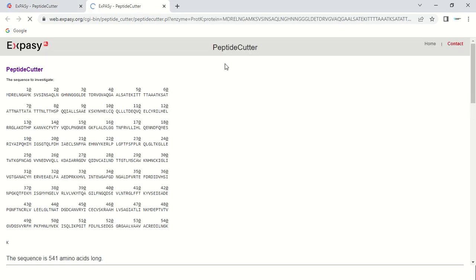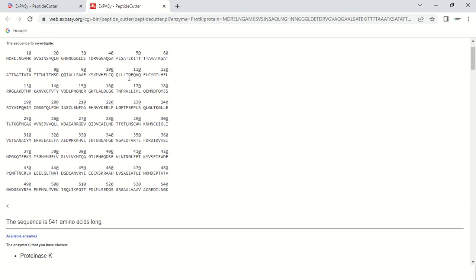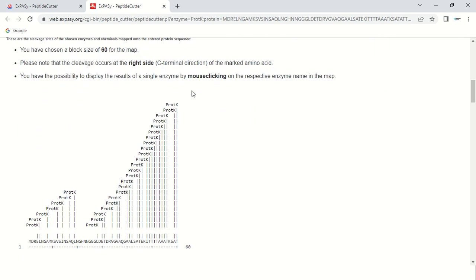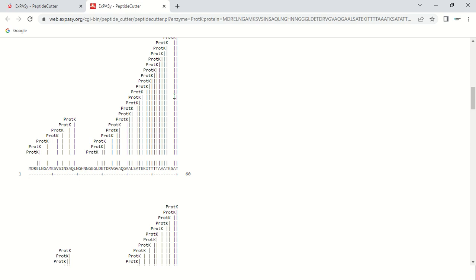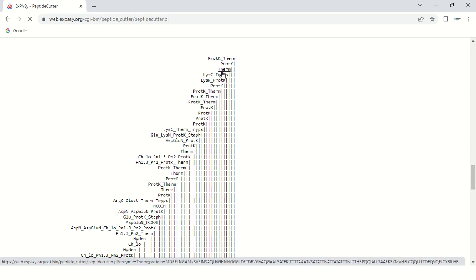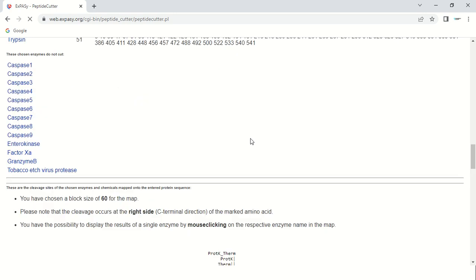Clicking on an enzyme name opens a new window showing the result for that particular enzyme. For example, clicking on Proteinase K shows that this sequence was submitted, and the result is specifically for Proteinase K. In this window, only the results for Proteinase K are visible — it has 284 cleavage sites in our sequence, at positions 4, 5, 8, and so on. There is also a graphical representation showing the cleavage sites of Proteinase K.